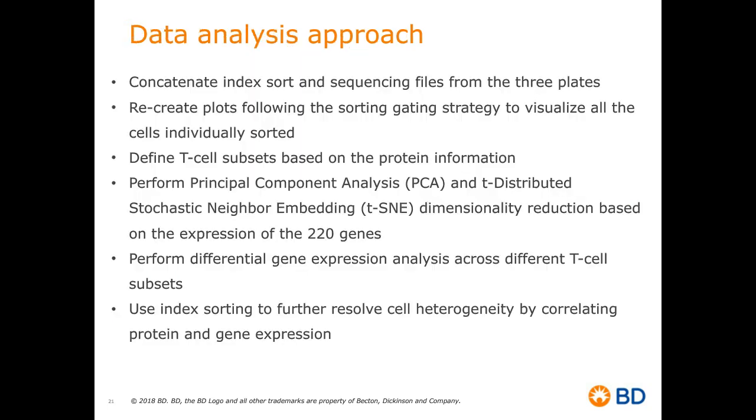And again, I want to guide you a little bit on the workflow, how we now approach the data analysis. Now we have information about protein, we have information about genes. We can analyze them individually, but most importantly, we want to integrate them, analyze them in an integrated fashion, and correlate protein and gene expression.